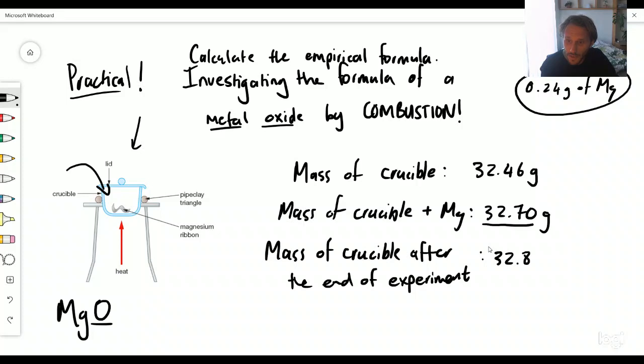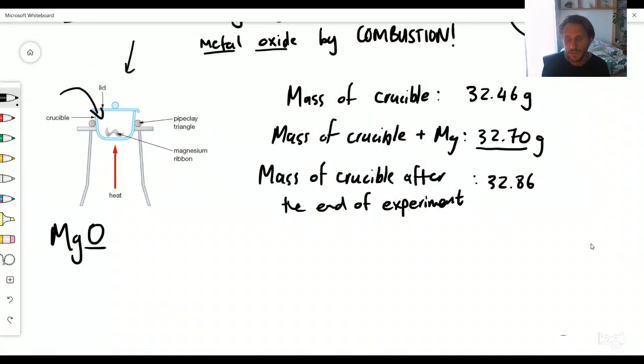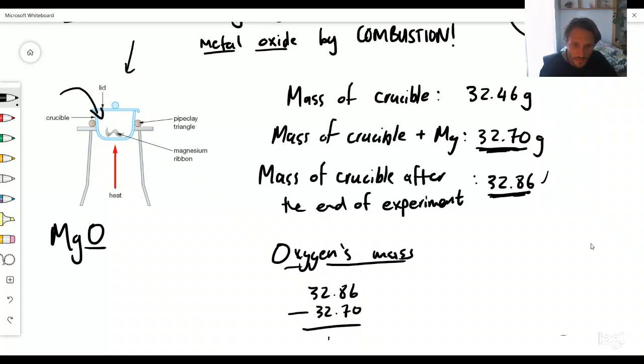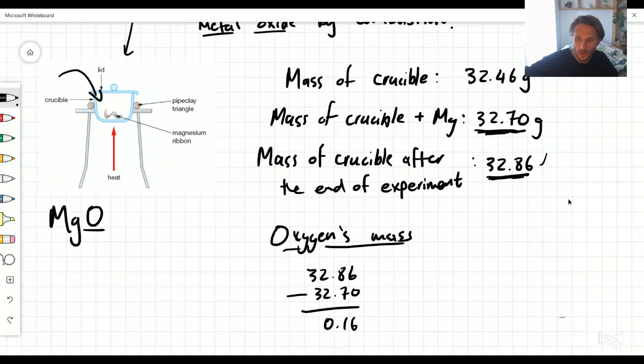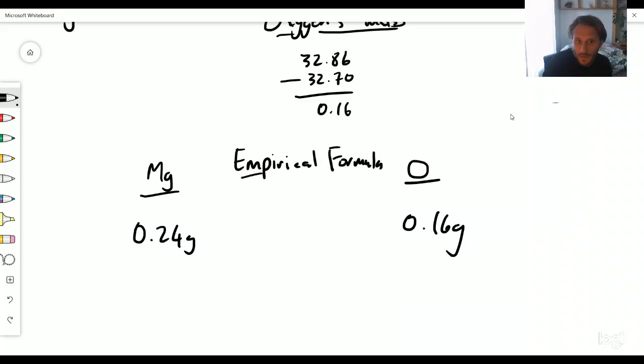So what I weighed it as is 32.86 grams. So if you think about this and you get a little bit clever here, we can actually work out how much oxygen did actually combine. Well, we can take this number and we can minus it from this number, because this is the weight of magnesium and this is after the reaction - we got a higher weight, so that must be the oxygen. So the oxygen's mass must be 32.86 minus 32.70, and what we get here is 0.16. So if we take both our values now that we've got - we've got magnesium, this weighs 0.24 grams from my initial calculation, and the oxygen weighs 0.16 grams.